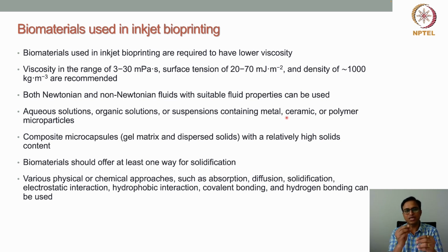But as soon as they come out of the nozzle and we deliver them to the printing stage or substrate, they should transform from the liquid phase into a solid, or a gel state. So that capability should be there when a biomaterial formulation is used for inkjet bioprinting.